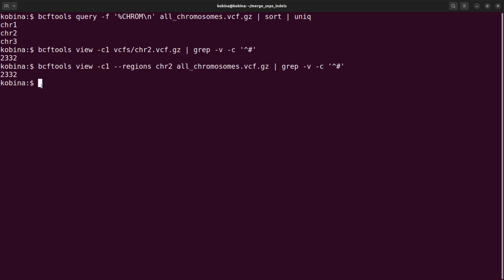All right. So now that we've done these two, what I want you to do is to try and do it for chromosome 3, and then send me your answers via the chat, via the message section, and then let's discuss it. Okay, that's going to be fun. All right. So that is it for scenario 2, whereby we combine VCFs from the same set of samples, i.e. chromosome 1, chromosome 2, chromosome 3, etc. VCFs. So in other words, we are looking at VCF files with the same set of samples, but then we have them split as chromosomes, and we are merging all of them, and that is what we have done here. So let's proceed.